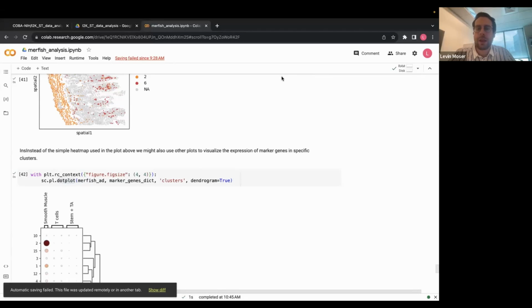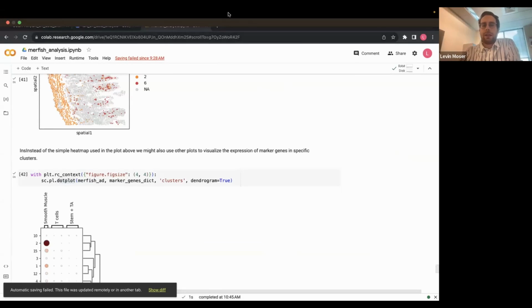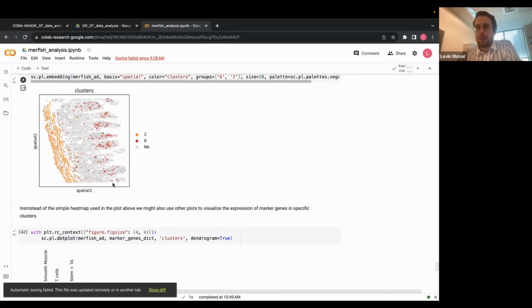In general, that's a very good question. Once again, I want to emphasize that when we are talking about the analysis of spatial transcriptomics, we really have an amazing collection of tools, especially with the ScanPy and SquidPy things. There are also others. When it comes to spot calling and segmentation, it's a different story.